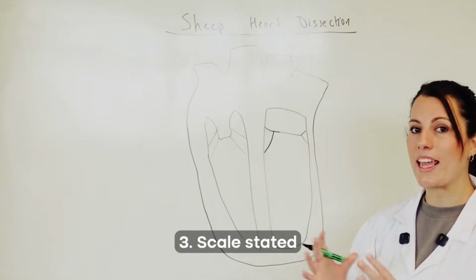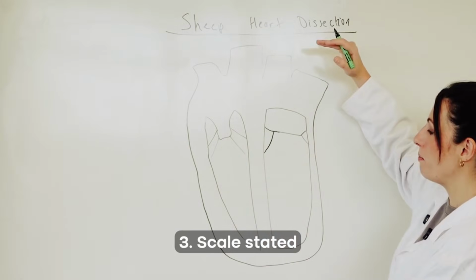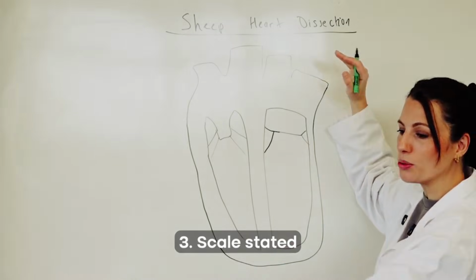Next, they would need to indicate the scale. Now, obviously, I've done this on a whiteboard, so it is much, much bigger than the actual size of the heart.